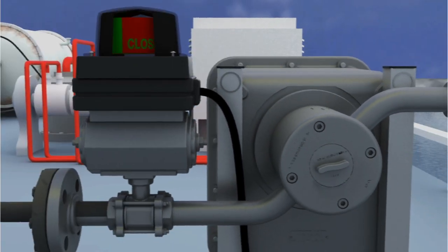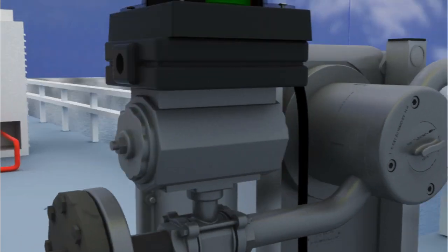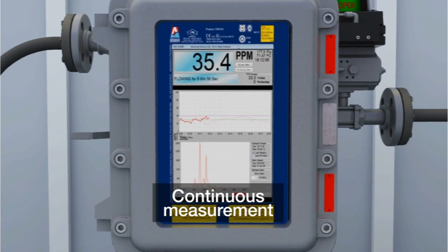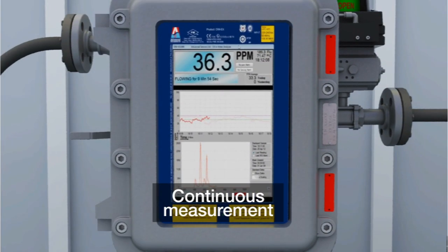The valve then reopens and the measurement cycle starts again. The analyzer will provide continuous measurement and reporting of discharged PPM.